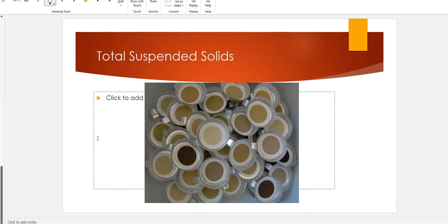But folks, it's really just kind of like waiting around for an hour and getting it back in the desiccator. During that 1 hour of heat, that would be a great time to go work on some lecture stuff or some remaining lab stuff that you need to turn in. And in 1 hour's time, your sample is going to be ready to be, ding ding, taken out of the oven, because guess what? Your cake is done.